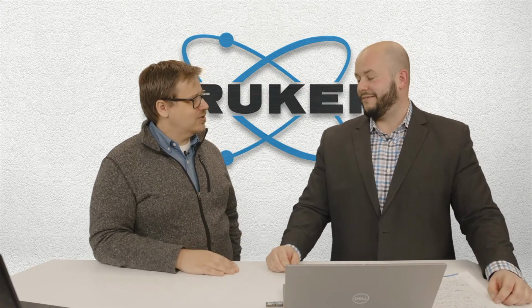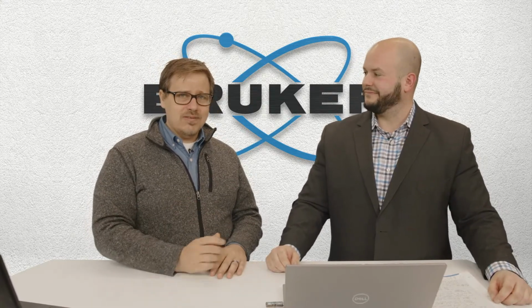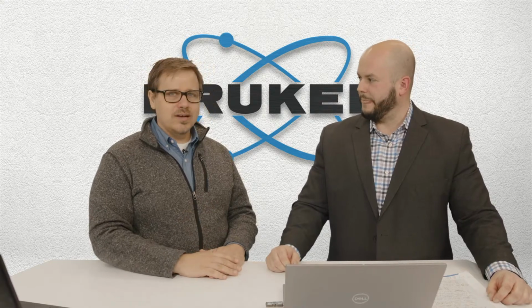But overall, actually, bigger is better. Generally, ideal is like a 3-inch wafer. That's beautiful, more signal. But a centimeter by centimeter works. I've even done 2 millimeter by 2 millimeter, no problem.